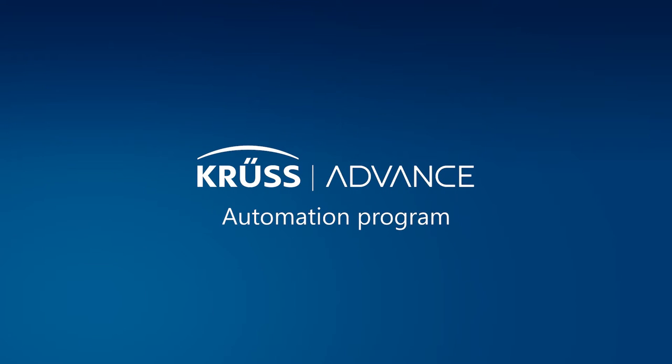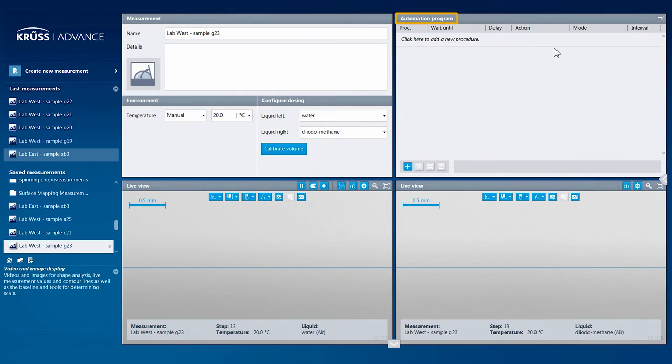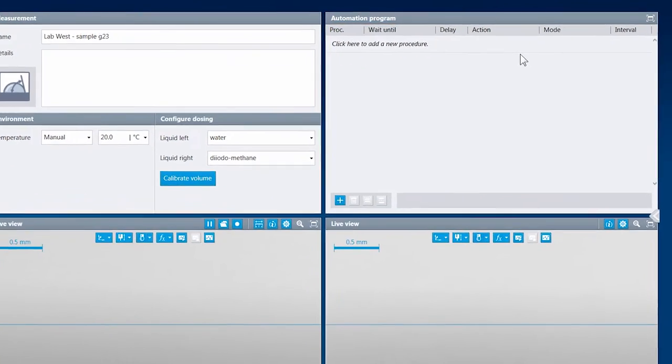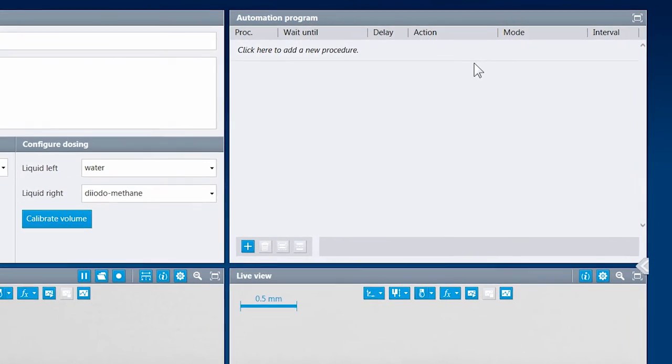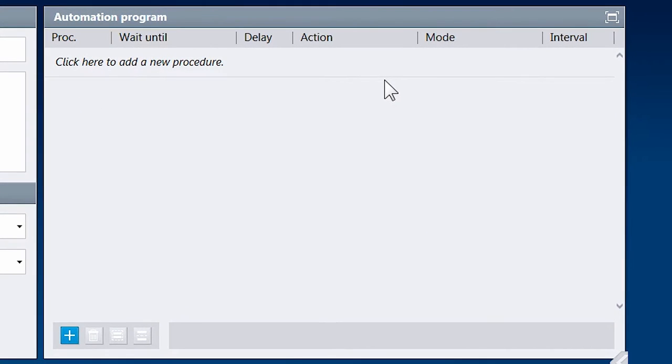To minimize result deviation, Advance includes an automation program which makes measurements completely user-independent, faster, and more convenient. The automation program is made up of a series of procedures. Each procedure is defined by the five elements: wait until, delay, action, mode, and interval, which offer enormous flexibility when programming your measurement automation.